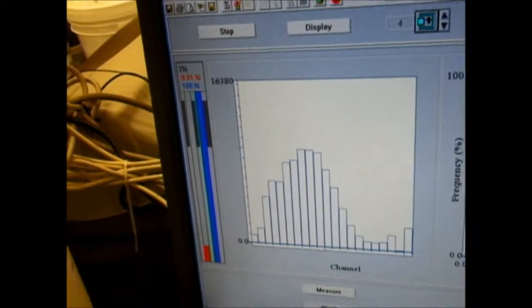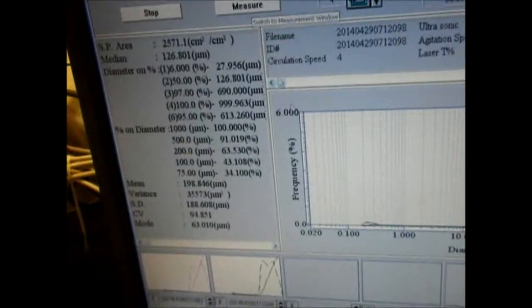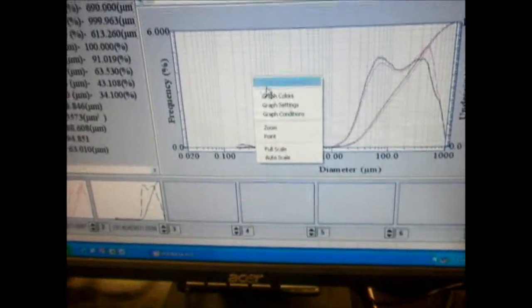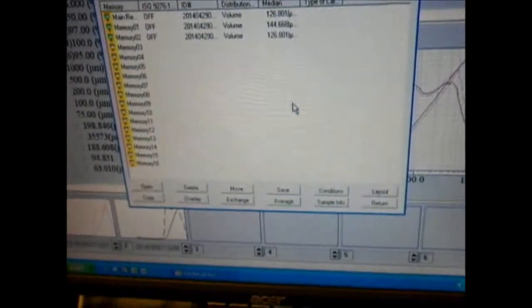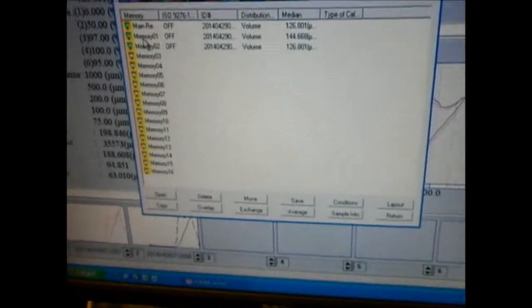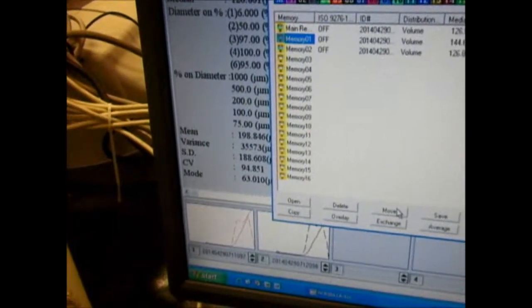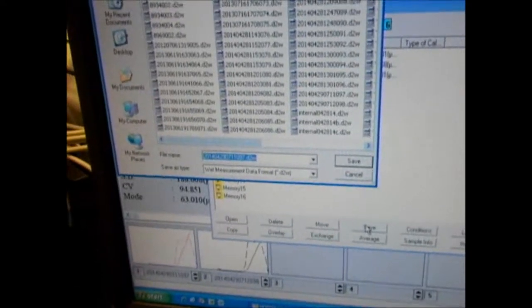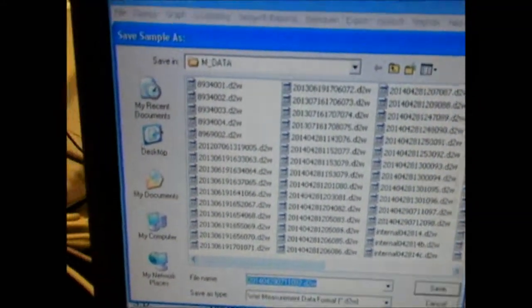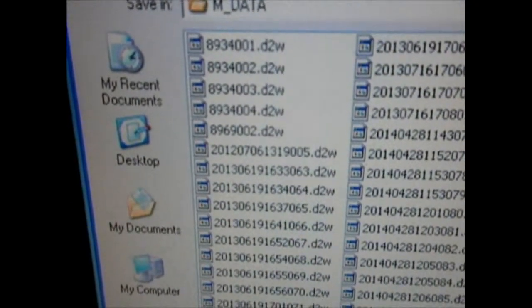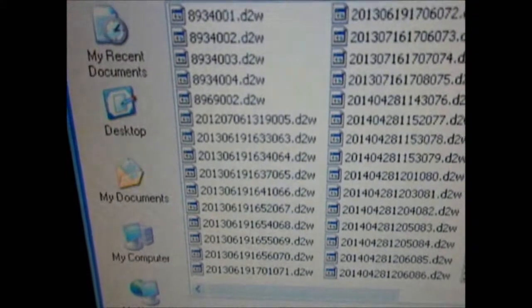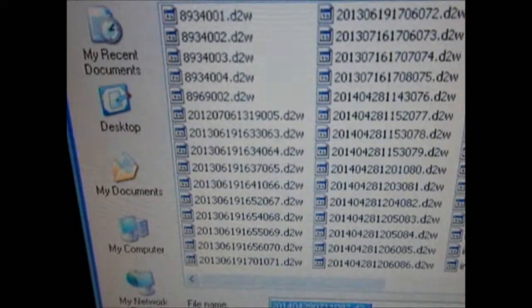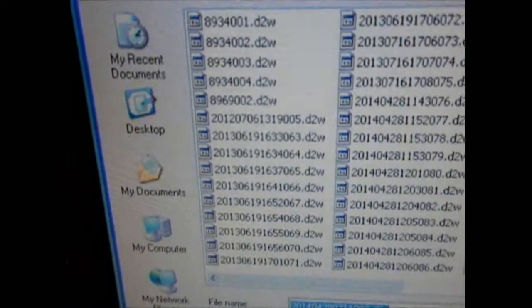To save the results, move the cursor to the display field and right-click. All data points have been stored in a memory slot, so move the cursor to Memory Operations and select the data point you want — here is memory one. Go to Save and save it according to the file number. Here at Avika and Woodbury, we generally save things by MO number followed by a three-digit code. You may want to use a WO number indicating a work order number along with another code.